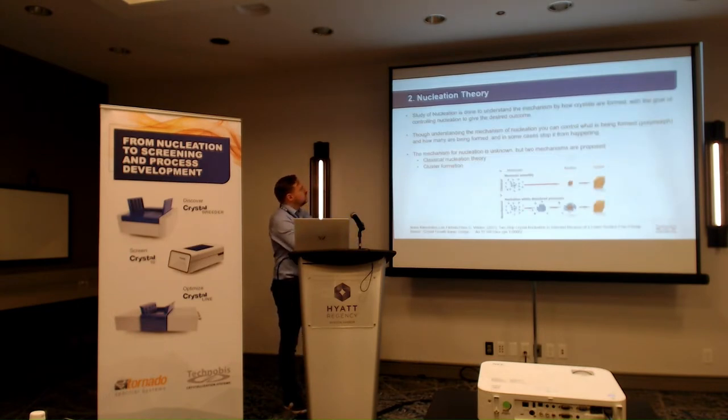So nucleation theory, the study of nucleation, is undertaken to understand how crystals are formed. With a greater understanding of how crystals are formed, we can then start to implement controls and ways of influencing it to give us the desired results. But in the understanding of nucleation, there's not a unified theory. Different people have different ideas about how nucleation occurs.